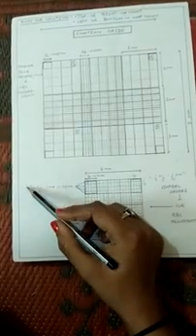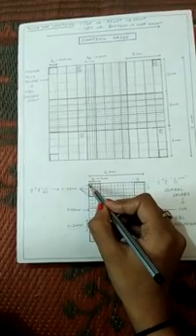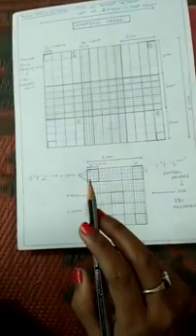So friends, this is a further small subdivision, and these are 16 small squares inside this small square, so here are further 16 subdivisions in this small square. So the length of this will be 0.05 because the breadth of this will be 1 by 4, and the length of this whole square will be 1 by 5, and 1 by 4 will be the breadth of this whole square. Then the length of this one small square will be 0.05.